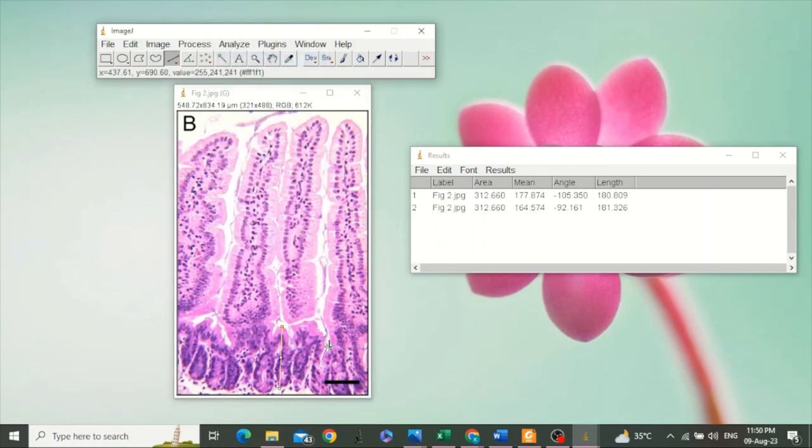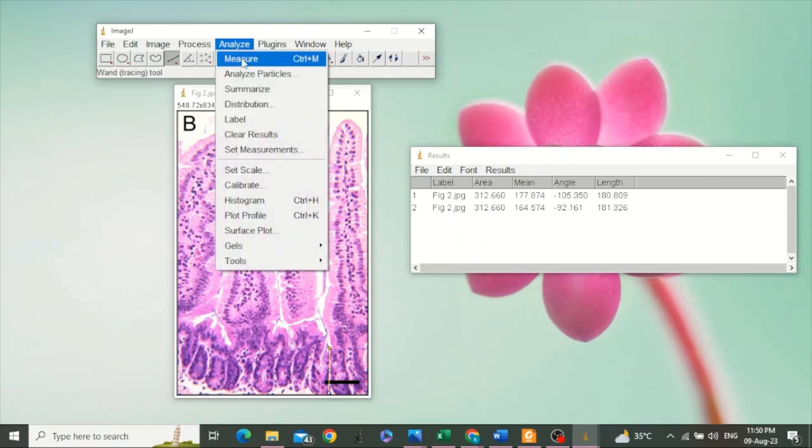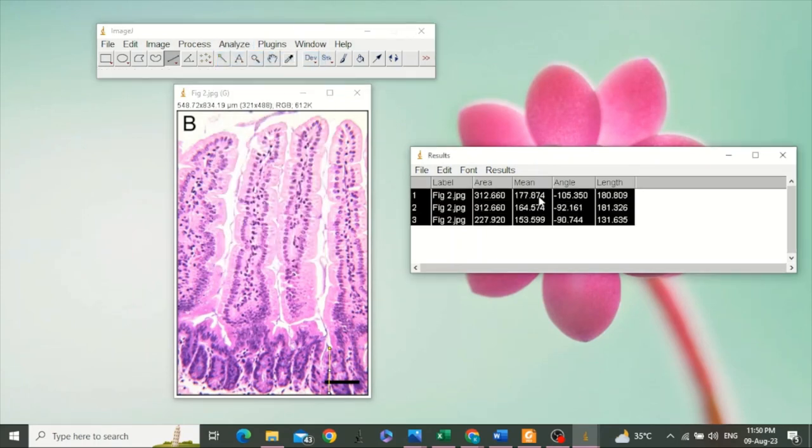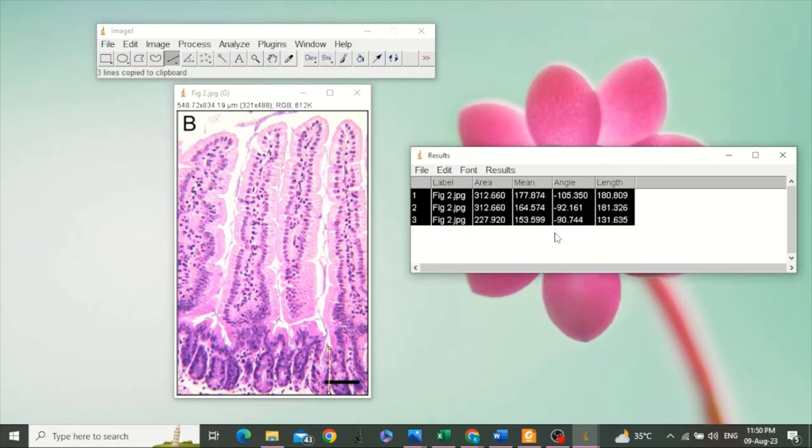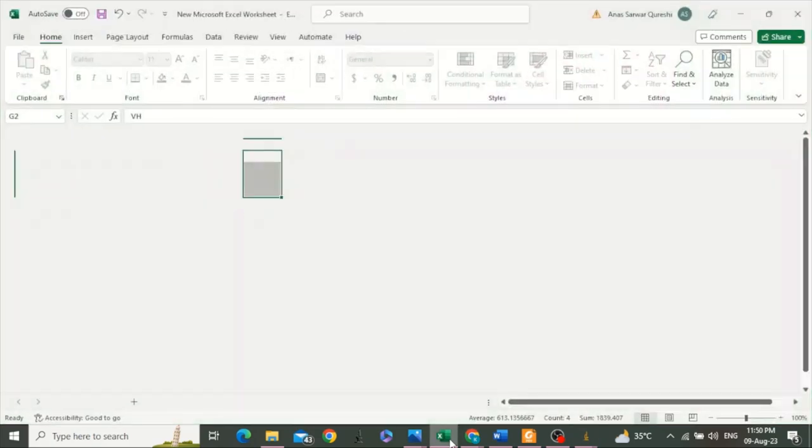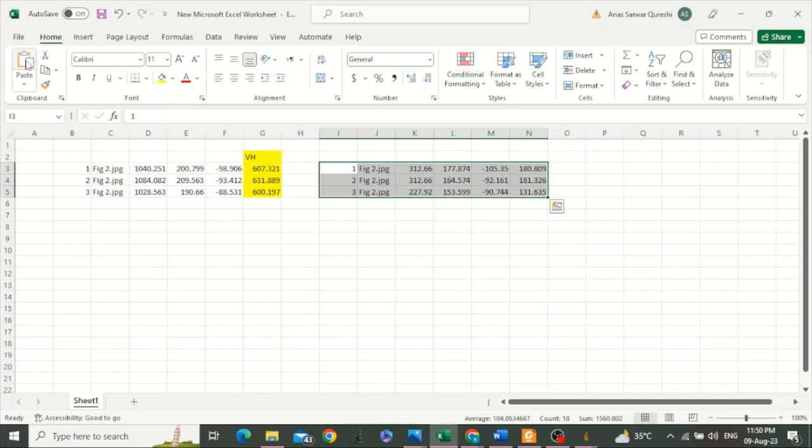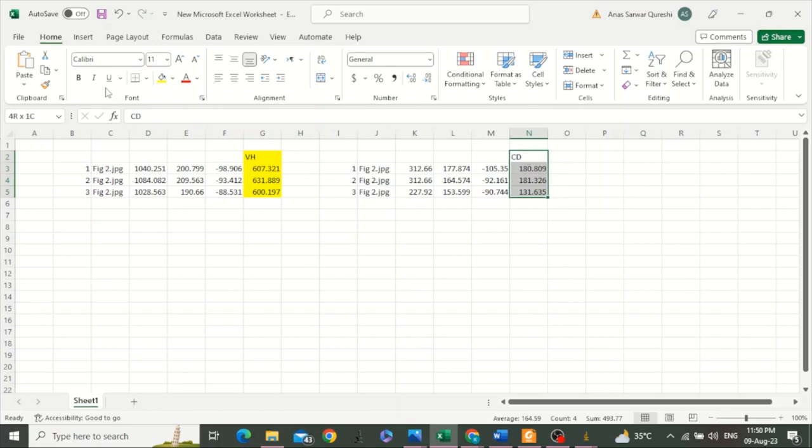And for the last measurement, we select Analyze and click Measure. We have got three values for crypt depth. Copy these and paste in your Excel file. Here, this is here. You may highlight.